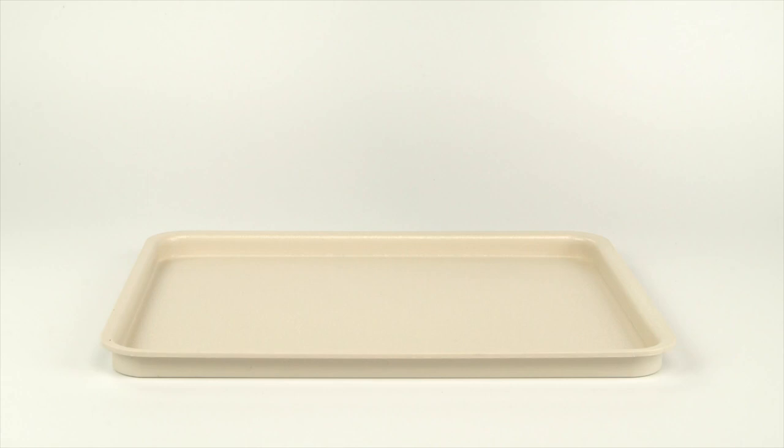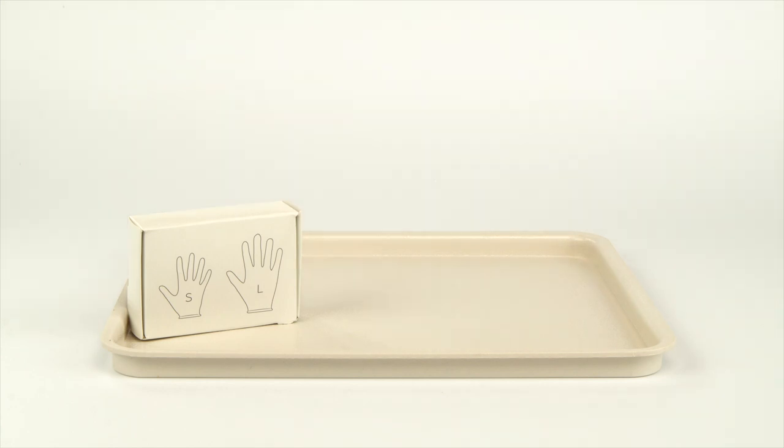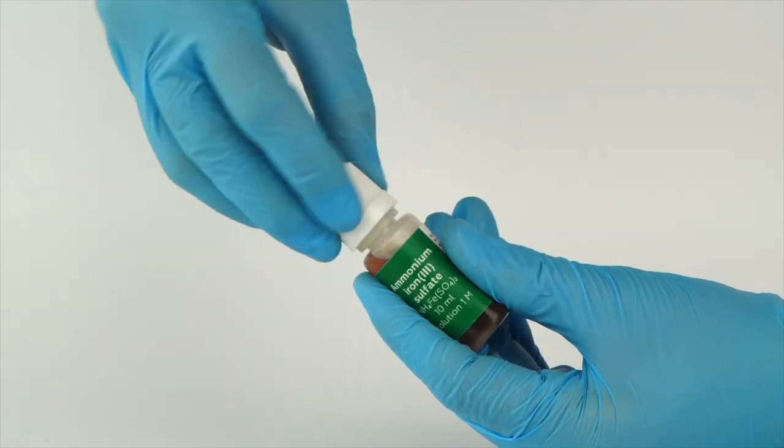Perform this experiment on the plastic tray to contain any possible spills. Don't forget to put on protective gloves and goggles before doing the experiment. To open a bottle containing a reagent, push the cap down and turn it.